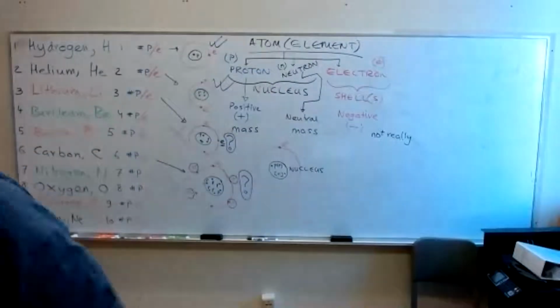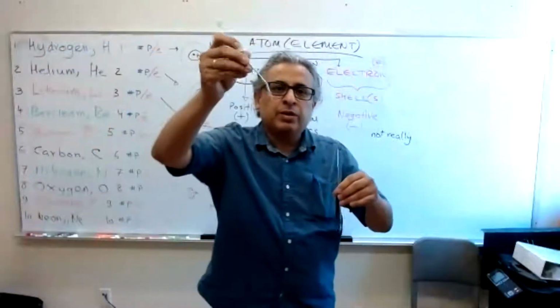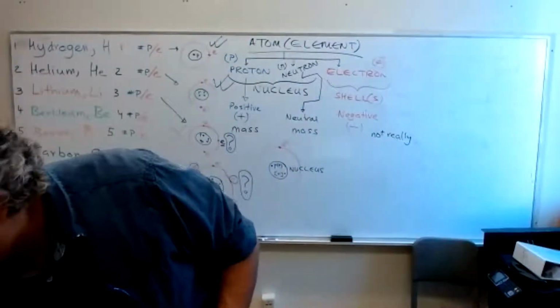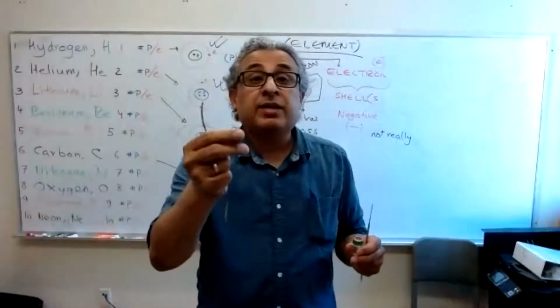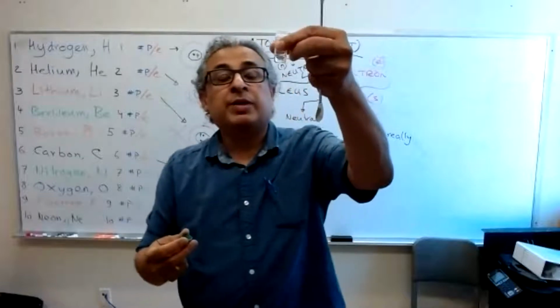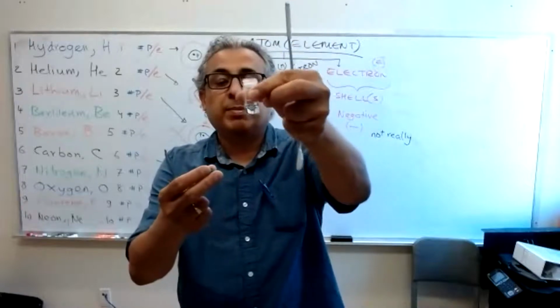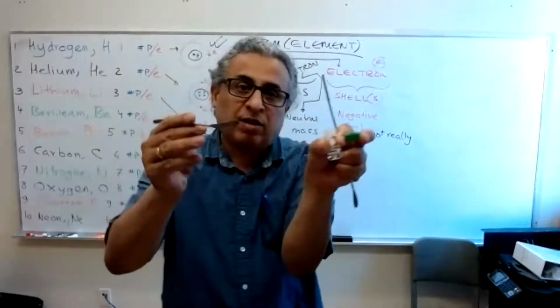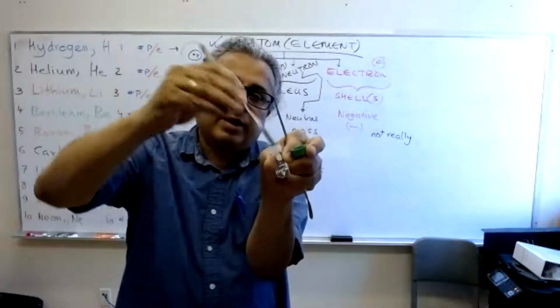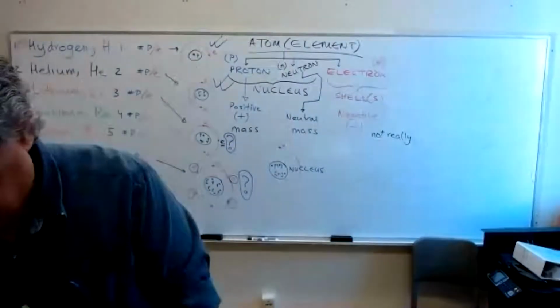What else do I have here? I think that's pretty much it. These guys are called spatulas. What do we use a spatula for? Let's say you have extracted 100 milligrams of caffeine from water. Now you're going to be taking a weight and submitting it to your instructor for final analysis. Your caffeine is sitting on a piece of paper and you're going to be transferring it using the spatula, okay? Like this, or a bigger spatula. This is just bigger, different sizes. So these are different things, okay?